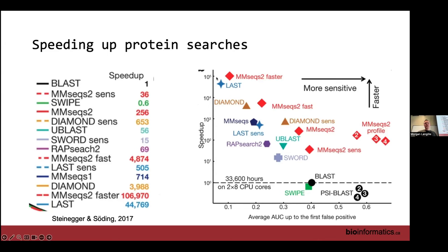And then you'll also see these options to either get coverage, which I can't remember what exactly the file format's called, or abundance information. And abundance is essentially actual counts normalized with all that MinPath fun stuff, while coverage is literally just presence, absence within that community. I don't think coverage is really that useful to me. I prefer abundance, but essentially you're left extracting these tables out of the annotation system and then doing stuff with it downstream.